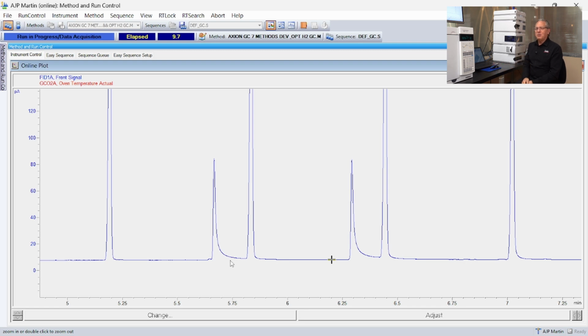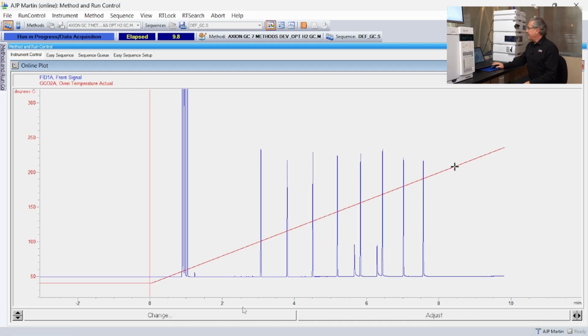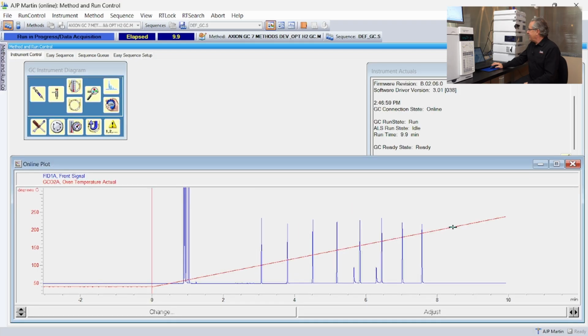Chances are there's a little bit of dirt in the liner, or a little piece of graphite has fallen in there, and that would cause the tailing peaks. So that's real life. I didn't plan that to happen, but welcome to my lab. Welcome. This is Lee on a Friday afternoon.